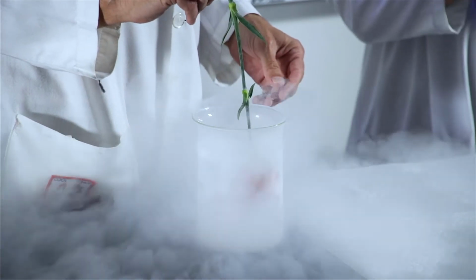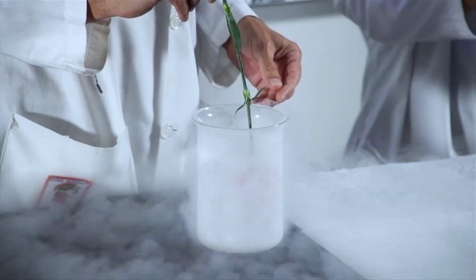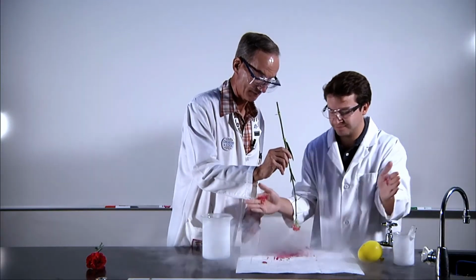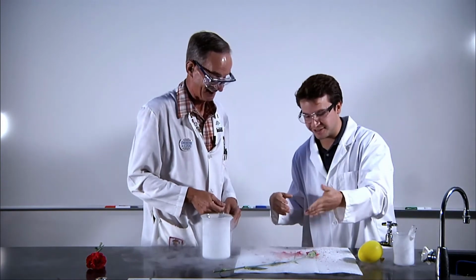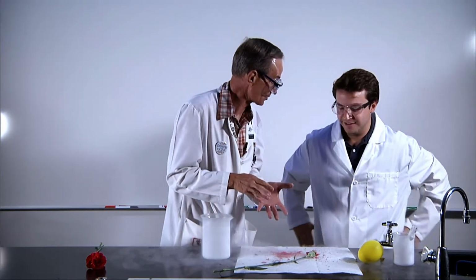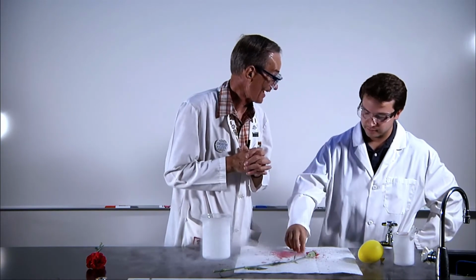1 1,000, 2 1,000, 3 1,000. We're getting some smoke again because of the water. The flower looks the same. And go ahead and clap it. And what did that feel like to you? Oh my gosh, it's glass. Yeah, that's a great description. In fact, a perfect description. It feels like really thin glass, cold, of course, as well. Yeah. So in 3 seconds, the nitrogen froze that solid.